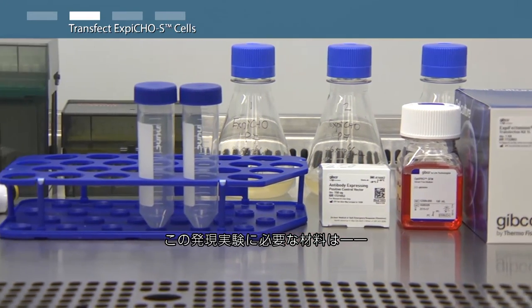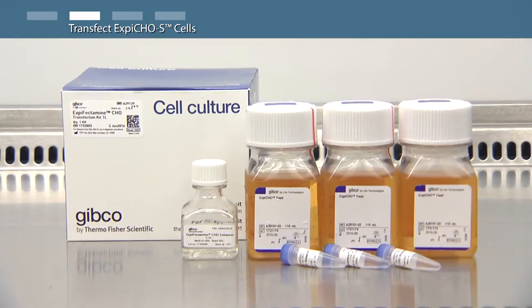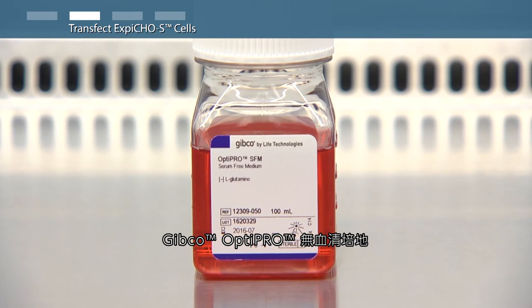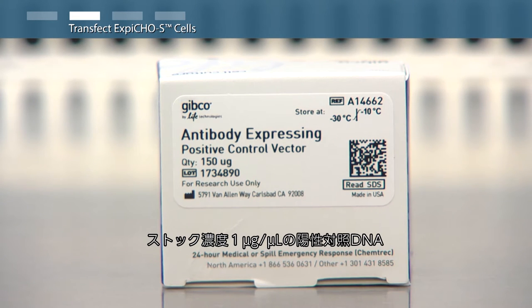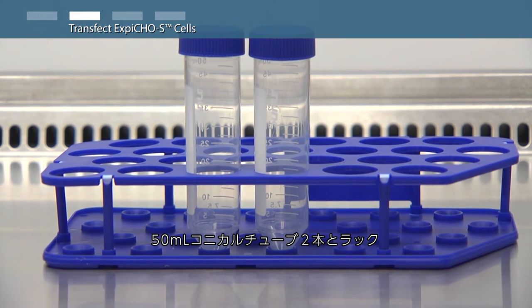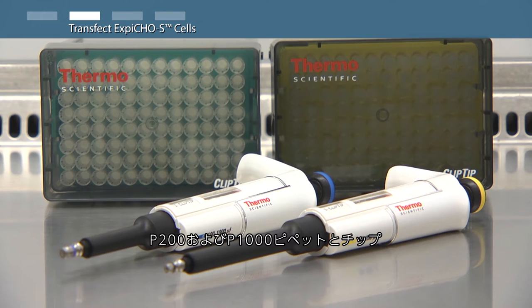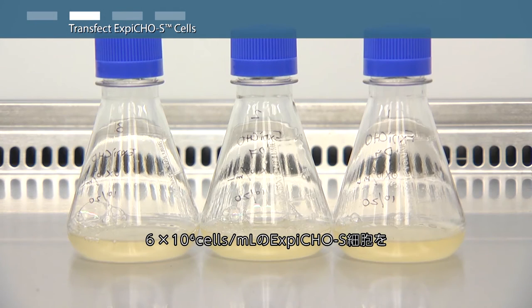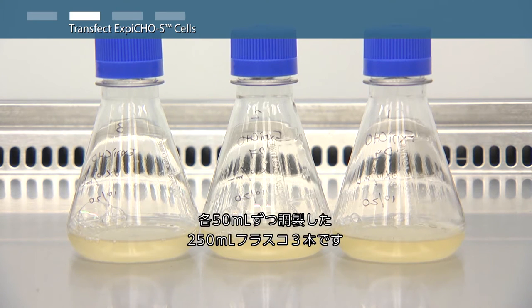For this expression run you will need: XBCHO transfection kit, OptiPro serum-free medium, positive control DNA at one microgram per milliliter stock concentration, two 50 milliliter conical tubes in a rack, a P200 and P1000 pipette and appropriate tips, a pipette aid device and appropriate serological pipettes, a marker and a timer, and three 250 milliliter shake flasks with XBCHO-S cells at a density of 6 million viable cells per milliliter in a 50 milliliter volume.